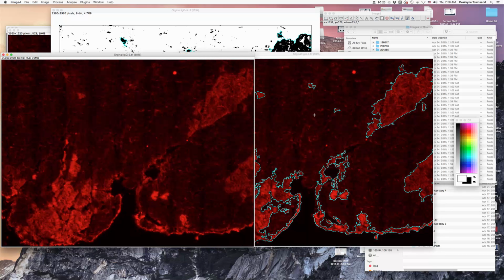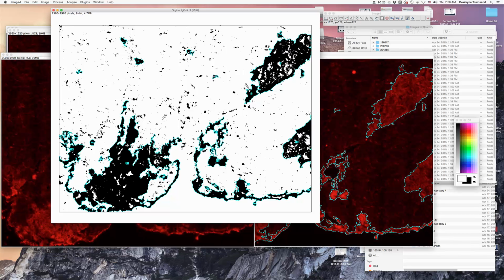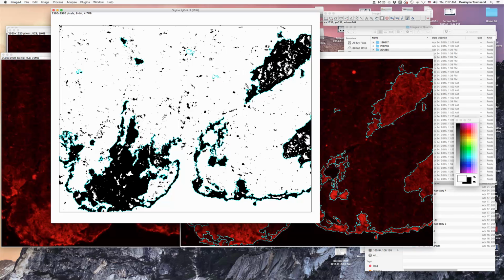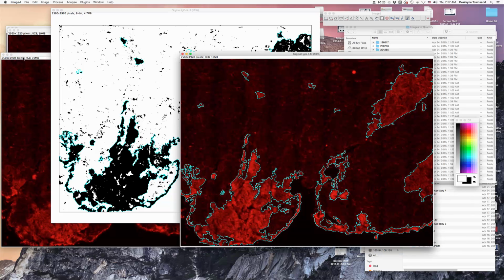Okay, so now there's a little bit of other cleaning up that we have to do. This area here, I would not be inclined to call that a myocyte. I think that's probably just a random fleck that set off the thresholder. And similarly here, this is another little area that's not a positive myocyte. So we need to go in and make sure those areas get excluded. Again, we're using the same little white brush to take those areas and remove them from the analysis. There's probably this area over here that doesn't need to be there. Okay, now let's see how we're doing.